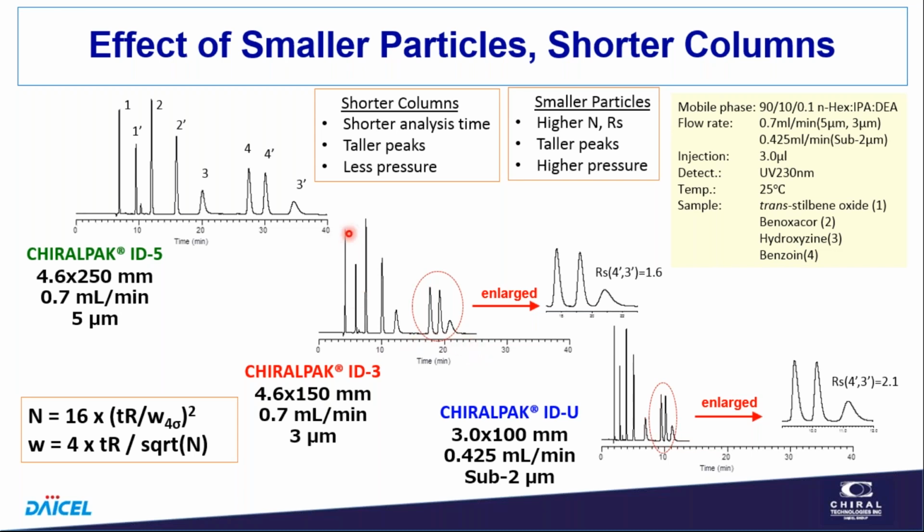These peaks are on the same time scale, but not the same response scale. But we can see that these peaks are sharper, so they will be taller because area is conserved. So this gives us an advantage. We see the same general behavior going to the smaller particles. I want to point this out.